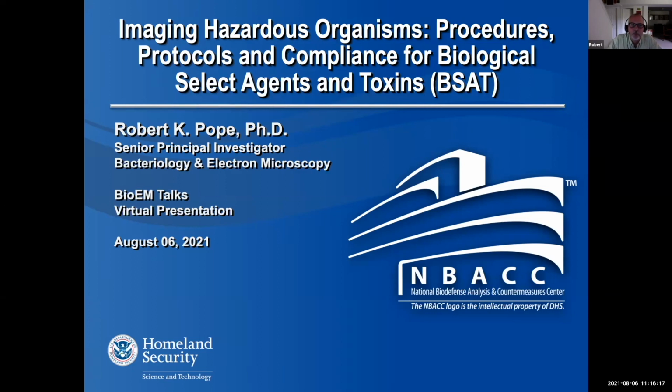So what I'm going to be talking about is imaging hazardous organisms, the procedures, protocols, and compliance for biological select agents and toxins. And as I go, I'm just going to pause and tell you things and try to give you an inclination of what we actually do, and try to tell you what I do without telling you what I do, if that makes sense.